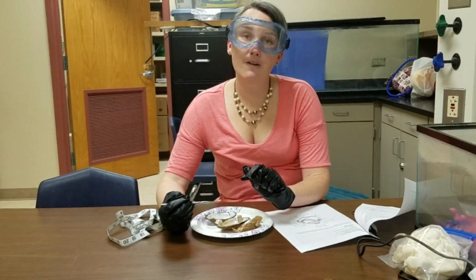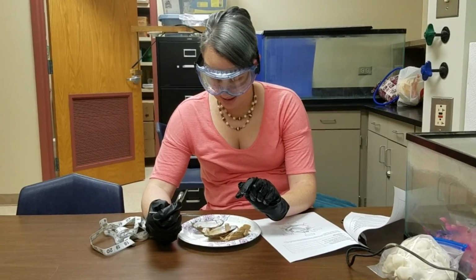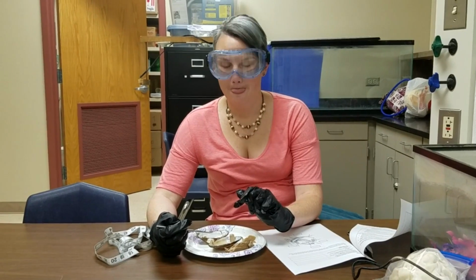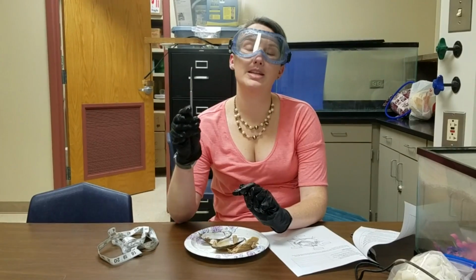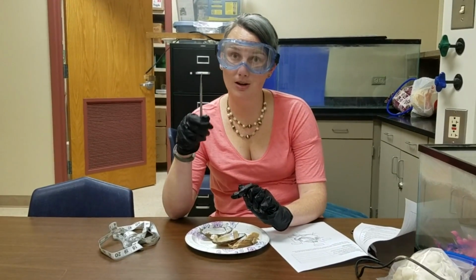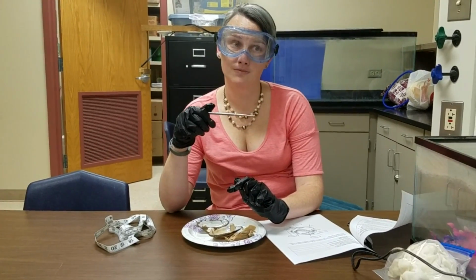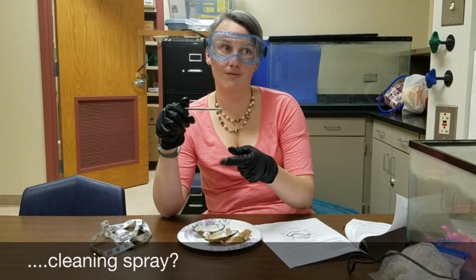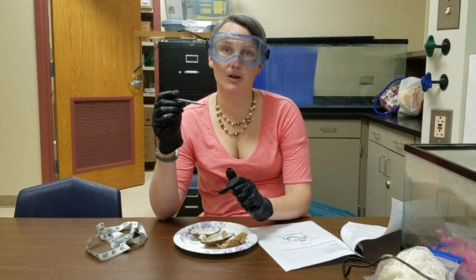Okay, so once you are finished and you've completed everything, you can clean up your areas. Make sure to throw all your stuff away, and make sure that everything makes it into the trash can. Please, please, please make sure that you wash your dissection tools with soap and water so that they're not gross for the next class. Spray down your desks with the cleaning spray, throw everything in the trash, and then put your dissection tools back where they're supposed to go.